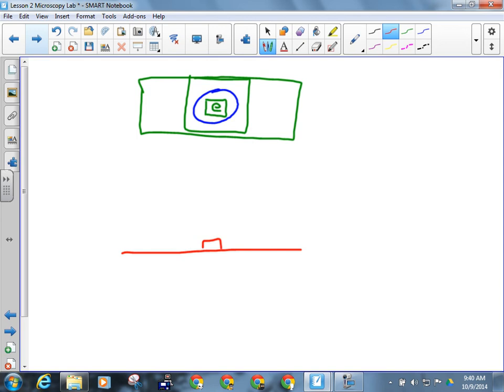Obviously, it's not that thick, but you need to be able to see it because we're looking at it from the side. Then you're going to take a little eyedropper like we used in the chem labs and drop some water on top of that. Now, when you do that, it'll probably flip the little clipping that you made over. That's fine. Just take some tweezers or your fingers and make sure that the letter E is flipped back right side up. Move it around a little bit so that it's stuck to the slide and it's right side up.